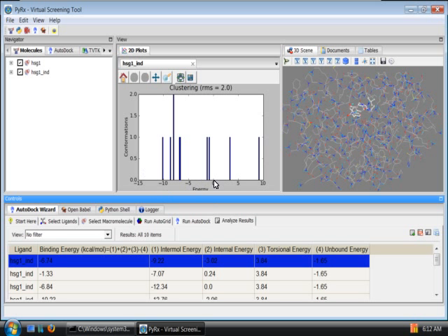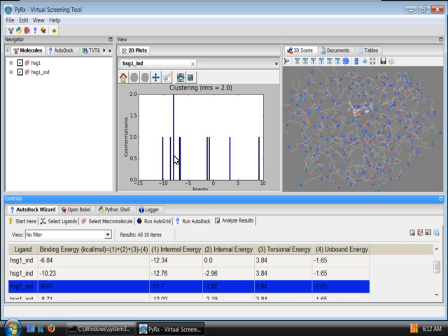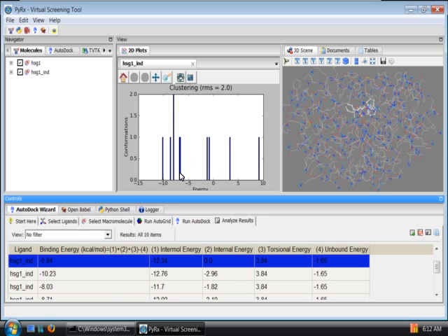You can navigate the docking by clicking on any of these bars here and it will update appropriate conformation on the 3D viewer and select appropriate row from this table.